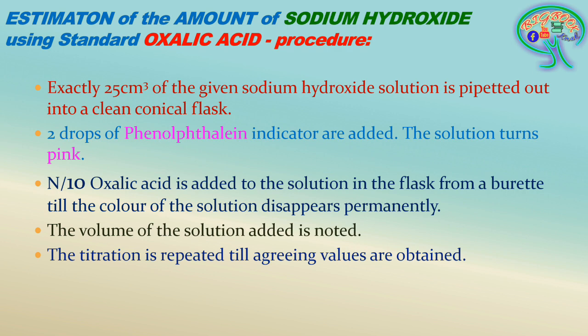of the oxalic acid. So sometimes what will happen while running down the oxalic acid solution from the burette into the conical flask, we will forget to look that the change in the indicator's color is going to happen, and we will overflow the volume from the burette. So here further, as the color disappears, we are going to take the readings of the burette which is having oxalic acid. The volume will be noted.